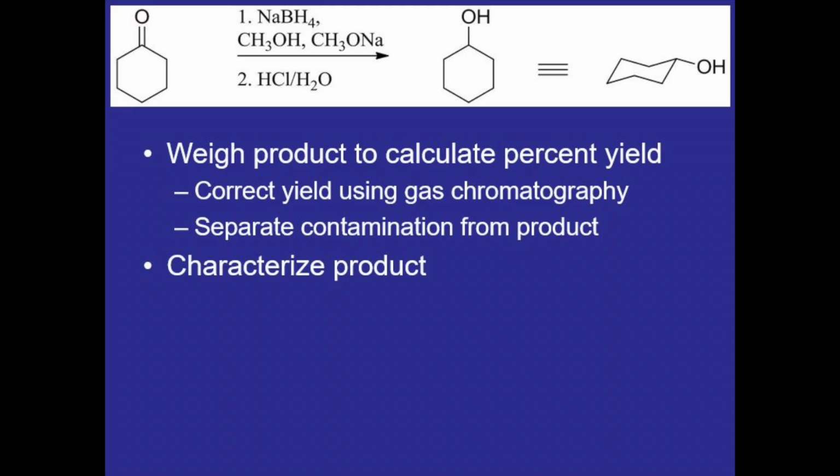And finally, at the end of the experiment, we'll characterize the product by running an IR spec.